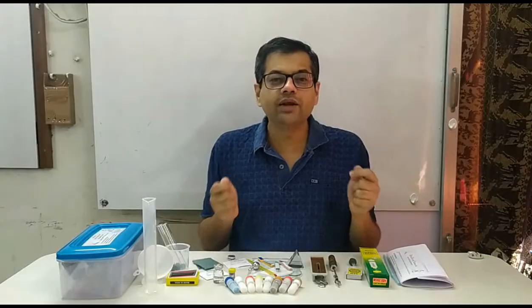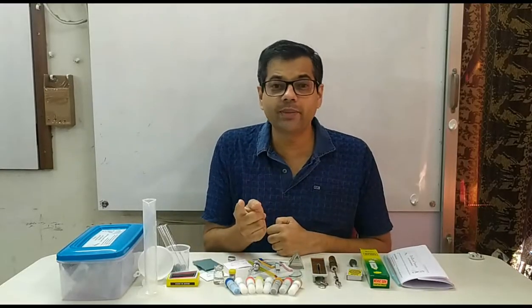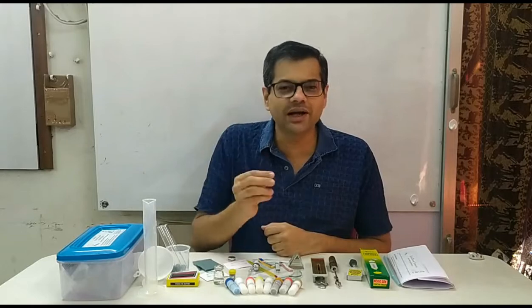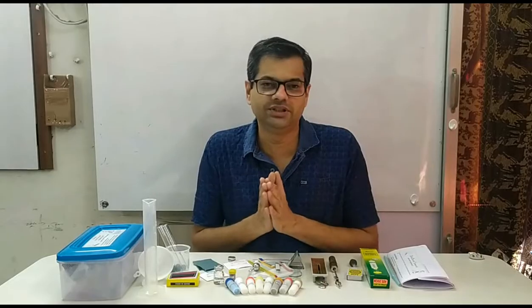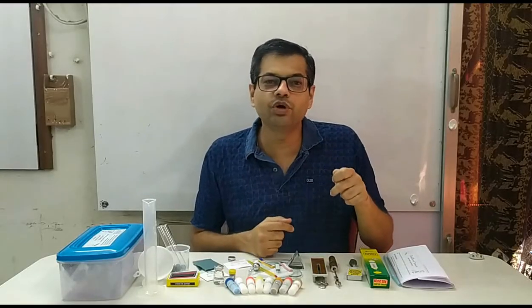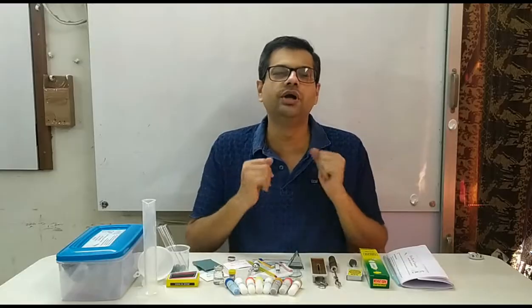With this science kit, you can verify the things which you have learned in theory. For example, in the science book you will study: if you take citric acid crystals and sodium bicarbonate powder and mix them, the dry powders don't react. The moment you add water, they will start vigorously reacting and bubbles will be observed. So with the kit material, you can do the experiment and verify. You would study about sublimation, properties of chemicals like copper sulphate, and finding density by measuring mass and volume. All these things can be done — verify the principles and the things which you have learned in theory.